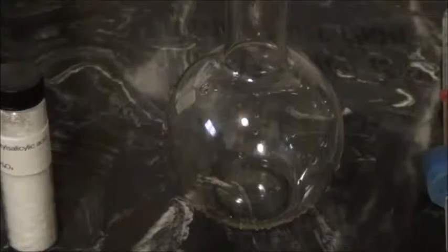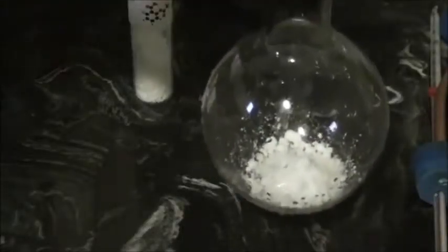In this step, we're going to be synthesizing salicylic acid. This is going to be synthesized from the acetylsalicylic acid, which is the main ingredient in aspirin.